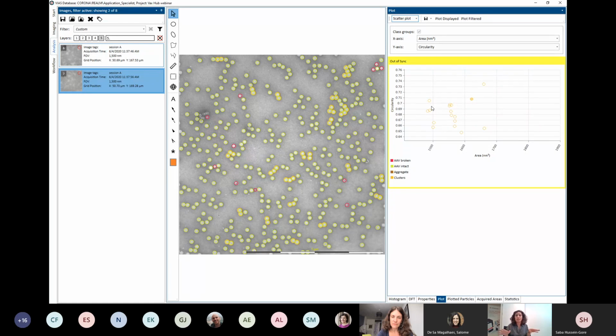And by reducing the spread of our electron beam, if you have it on not a single slot grid support, it works pretty nicely. Of course, the only thing is then that you do have some grid squares coming in, but sometimes some of these hexagonal grids can help you to reduce the interference of the grid support. We have clients as well that have got the MiniTEM system specifically for thin section analysis. So it's something that we are quite comfortable with. So yeah, I'll be happy to have a conversation with you and look at this further with more specific examples.